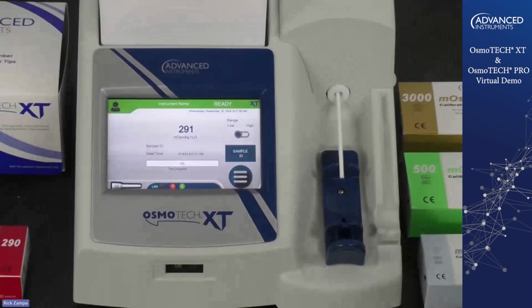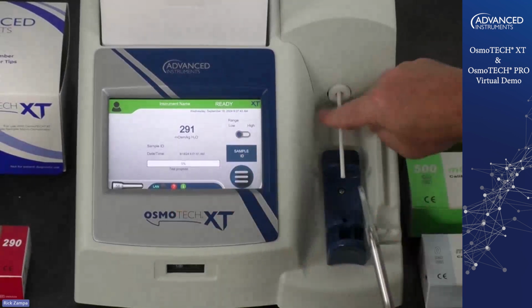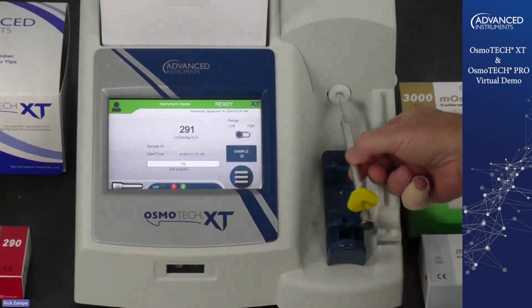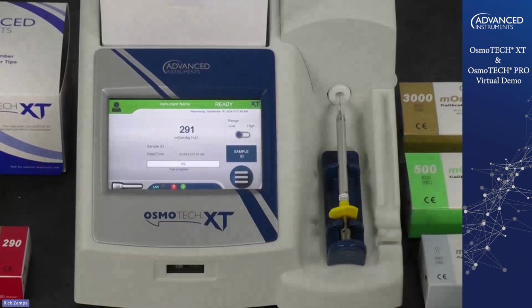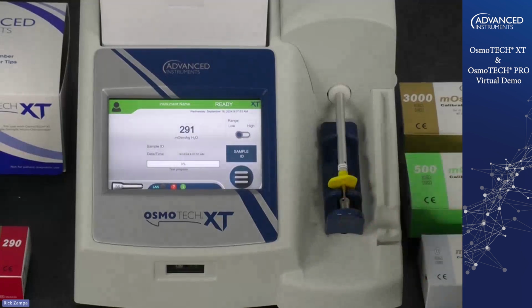I'm going to zoom back out so you can see next. So I have my sample loaded, I'm ready to go. I'm going to remove my chamber cleaner from the cooling chamber. I'm going to put the sampler into the cradle like that. And to start the test, all I have to do is slide this up into the instrument.